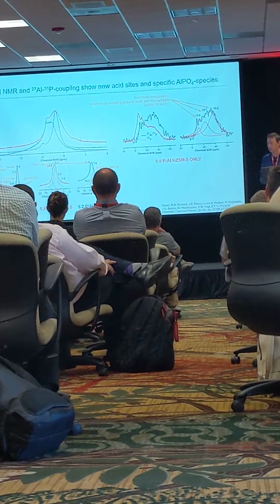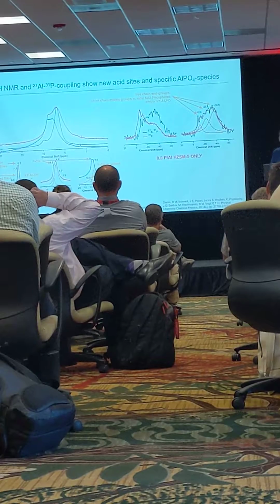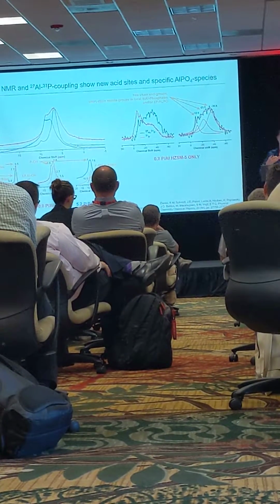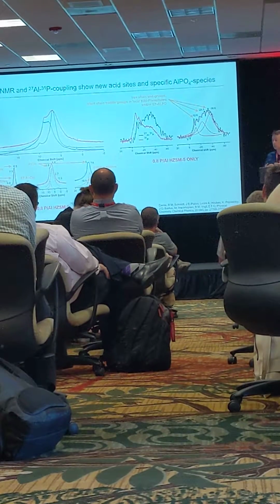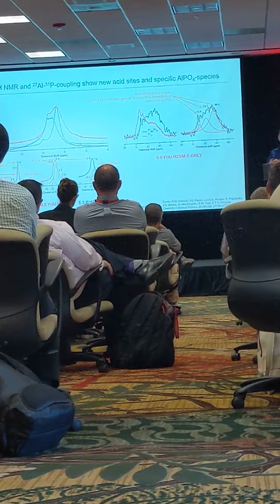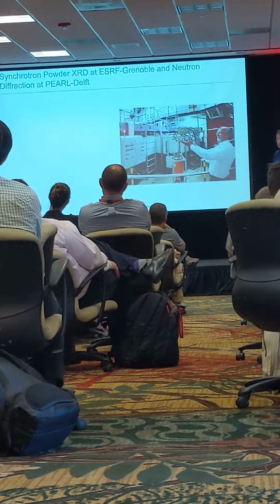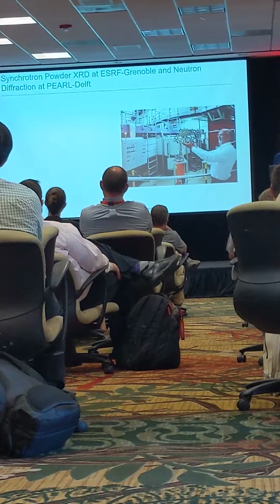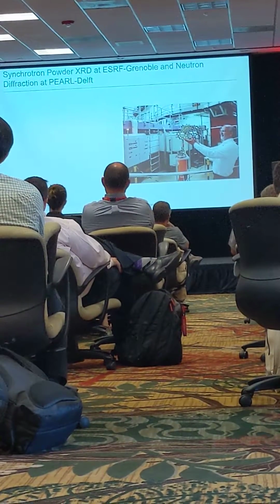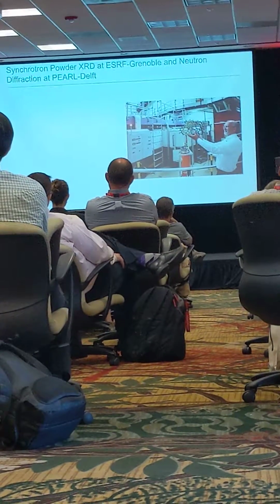On the right-hand side, we've got cross-polarized data between the aluminum-27 and phosphorus-31. And what that basically tells us is that the aluminum and phosphorus are in close proximity. So it's going to be things like extra framework AlPO, short chain middle groups, and free chain groups, okay? All right, so now we have an idea of the actual atomic bonds and species that are in this ZSM-5 that's been phosphated. The next question is, where are they in the crystal, and where are they located?